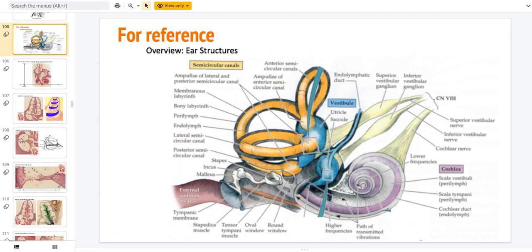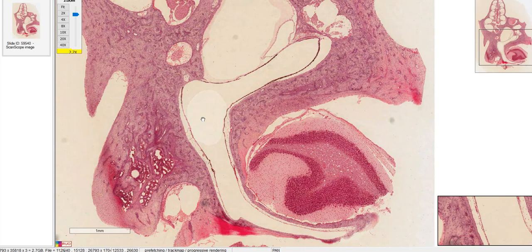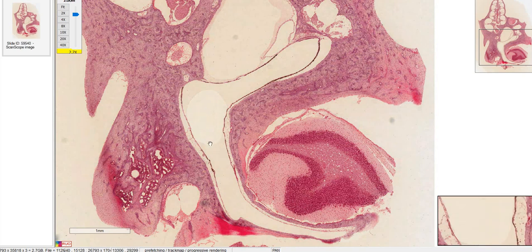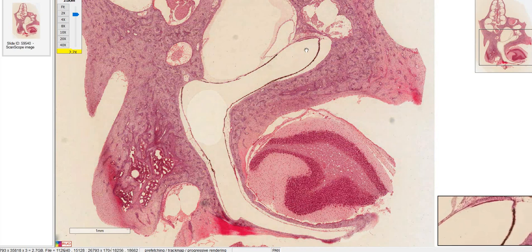Now let's talk about the vestibular system. The vestibular system is made up of the utricle and saccule, which detect the position of your head horizontally and vertically — so as you're walking forward or taking a big dive on a roller coaster, that's what's detecting it. The semicircular canals detect head rotation in all three planes. On our slide, this right here is part of the semicircular canal, and this part is either the utricle or the saccule — we don't know which one it is.